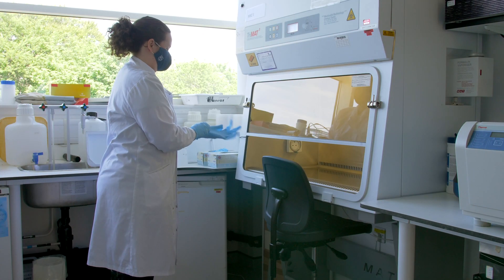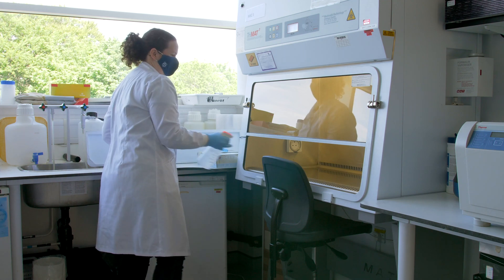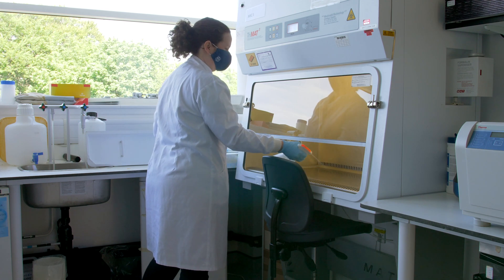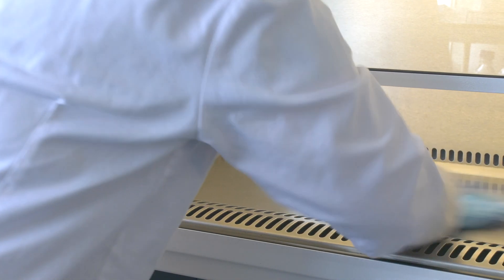When working with multiple brain samples, it is important to complete the entire protocol separately each time to prevent cross-contamination. 70% ethanol should be used to sterilise items placed into the hood before use.